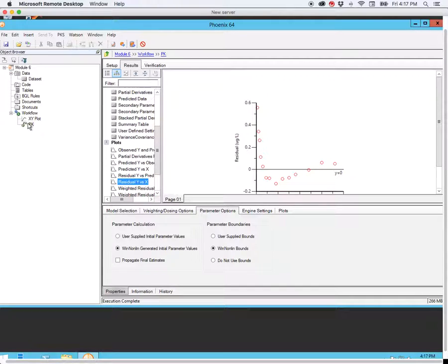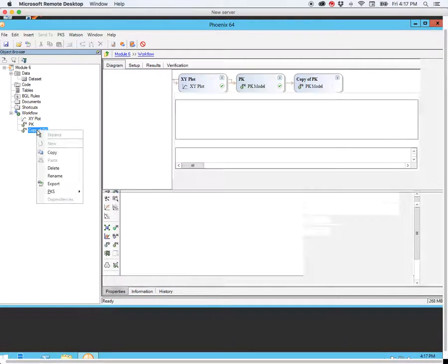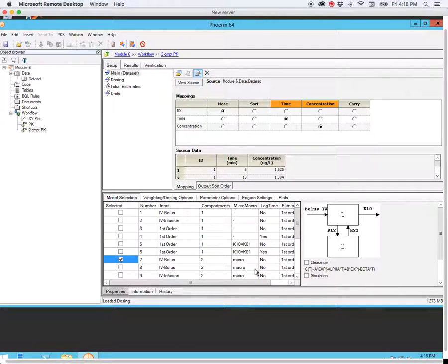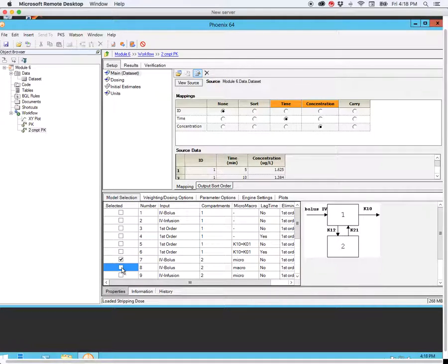All of this suggests that we should try a two-compartment model. I'm going to copy this and paste it into my work file, renaming it as two-compartment. Now I'm going to select the IV bolus for a two-compartment model. Whether we choose micro or macro does not really matter — it's the same model. However, when you determine your initial estimates by curve stripping and the residual methods discussed in Module 6, you'll notice that the parameter values you estimate in that way are A, B, alpha, and beta — these are the macro constants. So if you want to enter those hand-calculated values as your initial estimates, the macro constants option is the best choice.